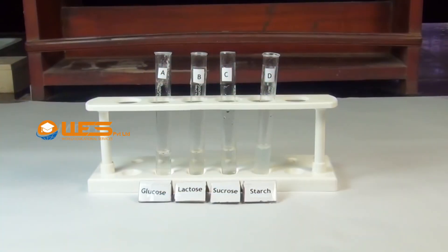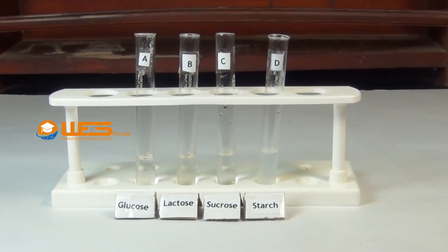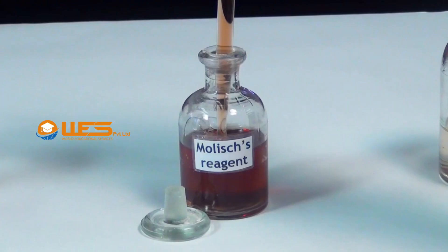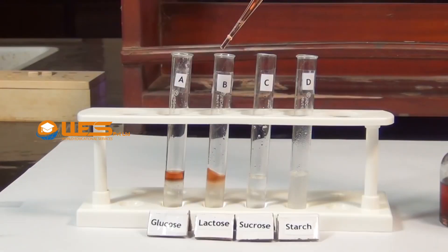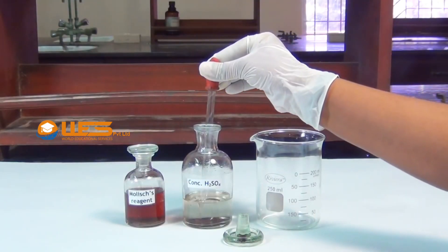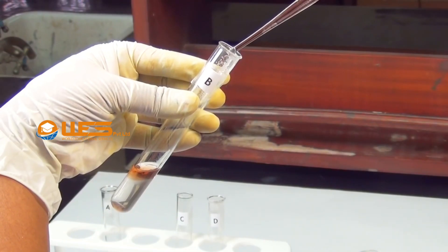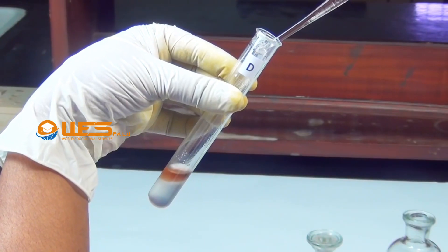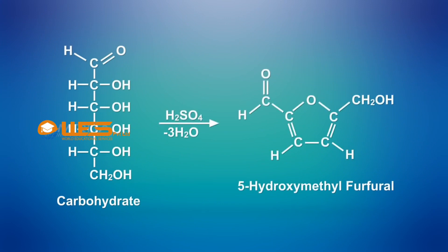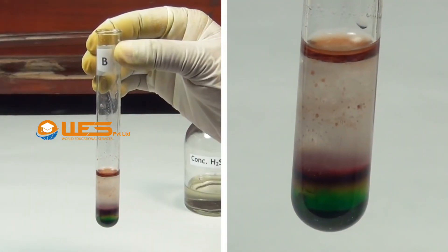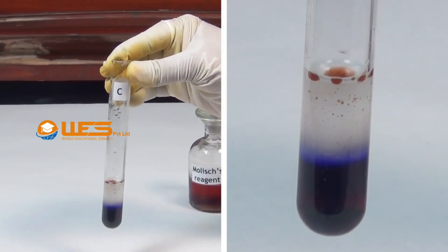Molisch Test. Take a small quantity of aqueous solutions of glucose, lactose, sucrose and suspension of starch in four test tubes A, B, C and D respectively. Using a dropper, add a few drops of Molisch reagent to each test tube. Then pour a small amount of concentrated sulphuric acid slowly along the side of each test tube. Concentrated sulphuric acid dehydrates carbohydrates to form furfuraldehyde or its derivative, which further reacts with alpha-naphthol present in the Molisch reagent to form a coloured product that appears as a purple ring at the interface between the acid layer and the test layer.